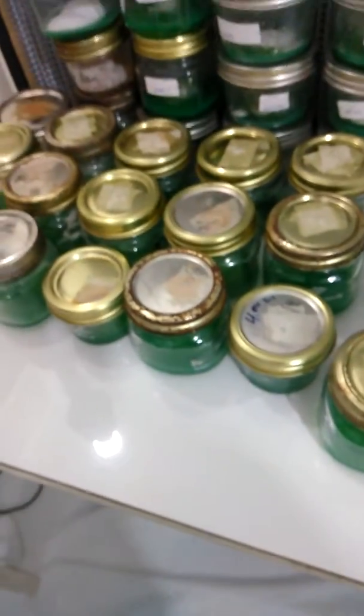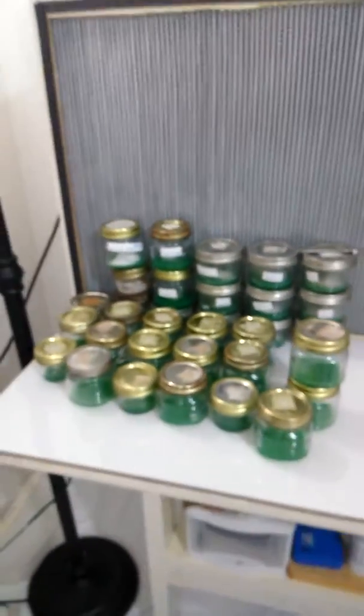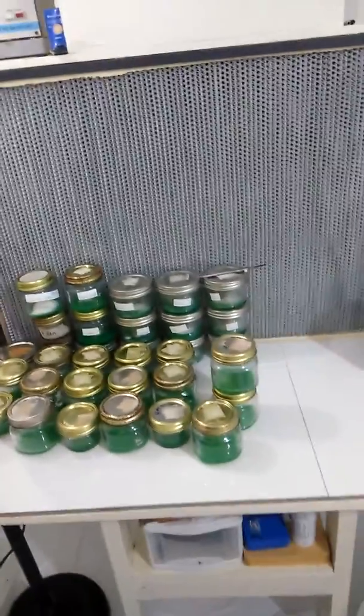My agar mix is 500 milliliters of water to 10 grams of light malt extract and 10 grams of agar, the Telephone brand. I will adjust that based on what I'm trying to accomplish. Sometimes I'll add other nutrients to it. I'll get into that in another video.